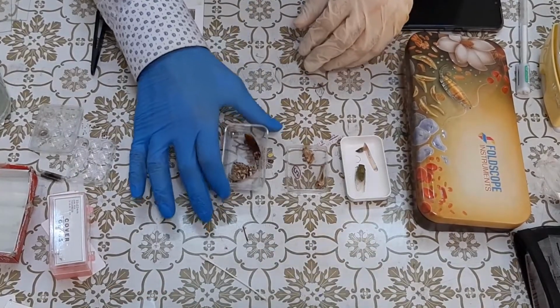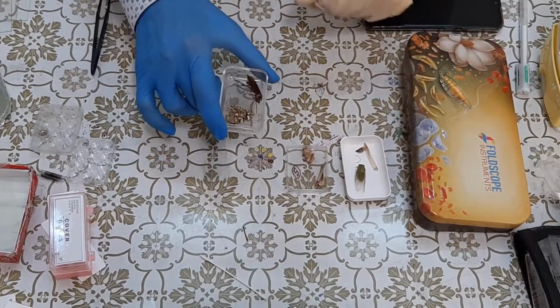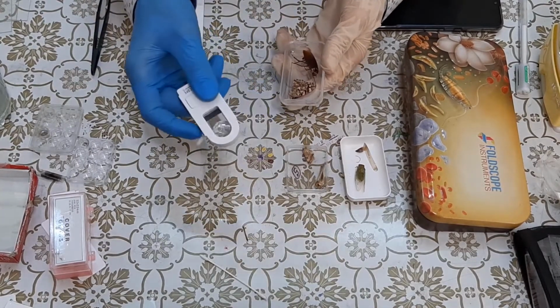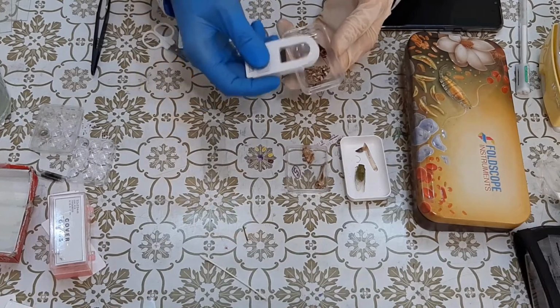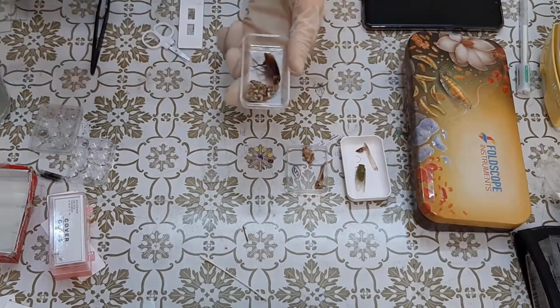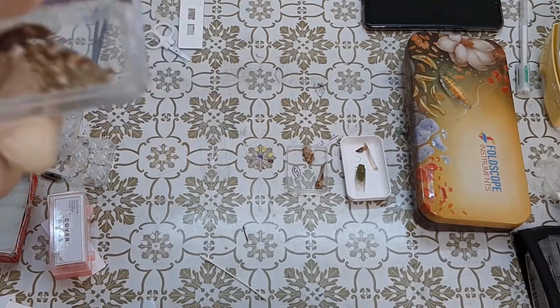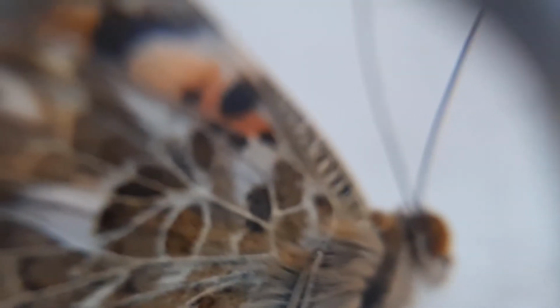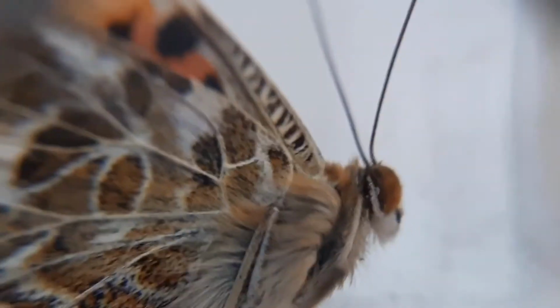First of all, I'm going to show you the specimens before preparing the slides. Here, I'm going to take the Foldscope magnifier to zoom in on the samples. So let me first show you that here we have this cricket and butterfly. This is the butterfly.